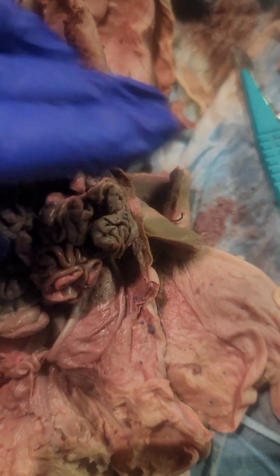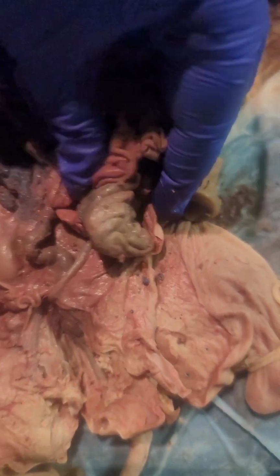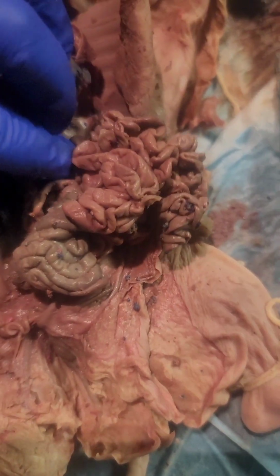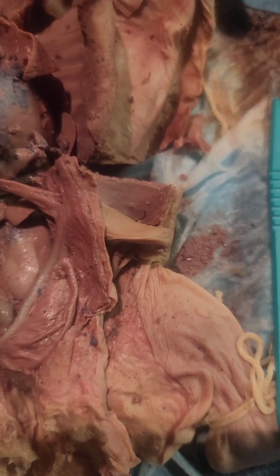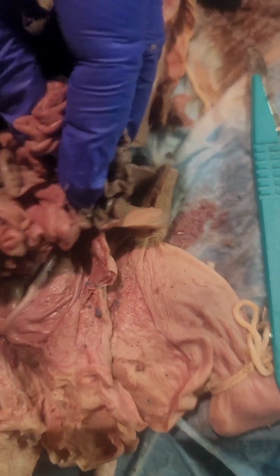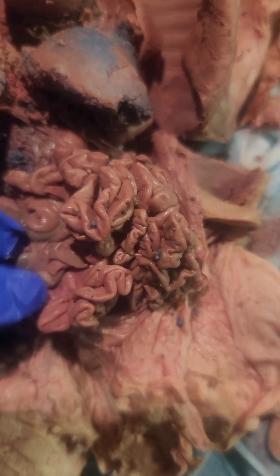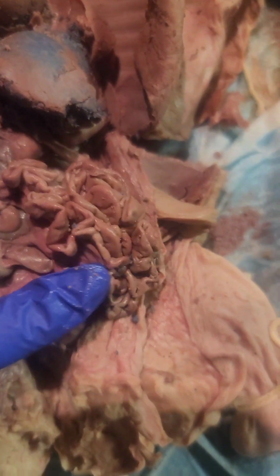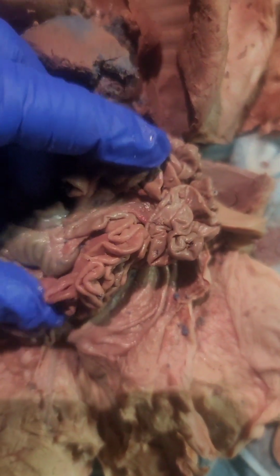The pyloric sphincter is at the top, or I guess at the bottom, however you wish. It's hard to see it, but it's right there, I do believe.